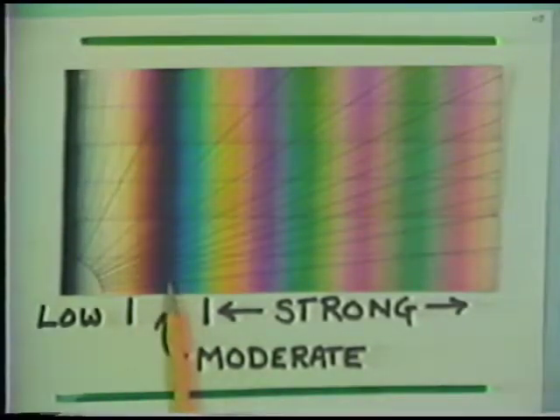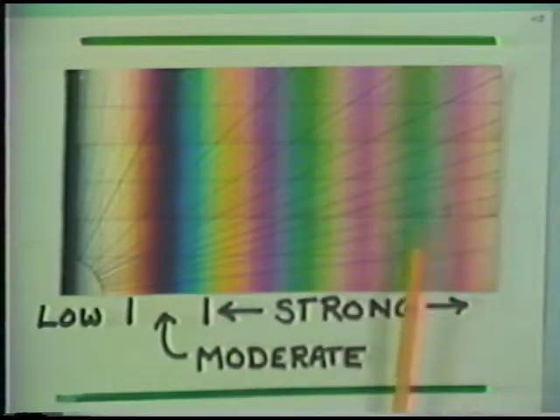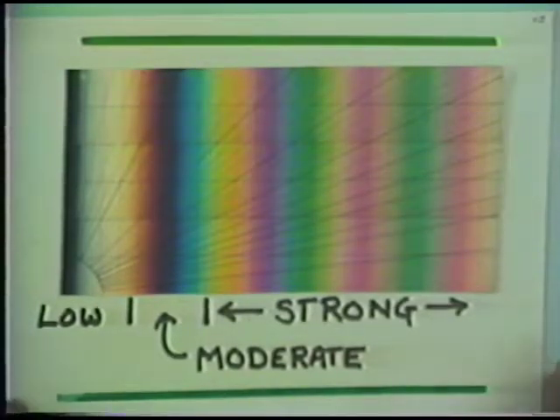And as soon as we reach this blue, we're talking about moderate birefringence. Birefringence within this range is shown, for example, by the orthopyroxene. Strong birefringence is within the olivine range. And finally, way off the end of this scale would be the very strong and extreme birefringence that is shown by calcite and rutile.